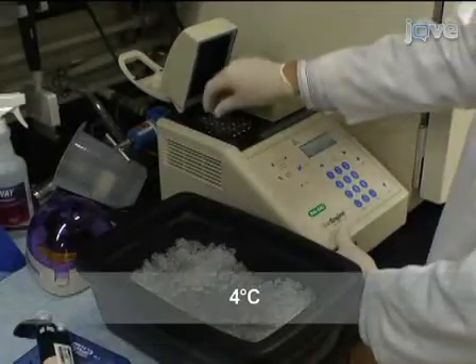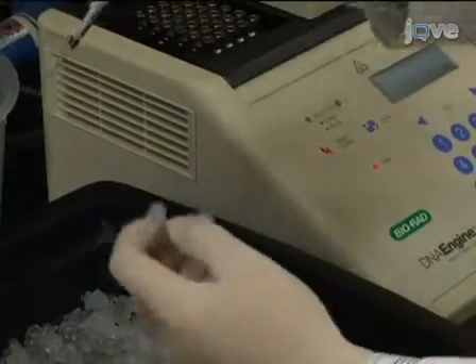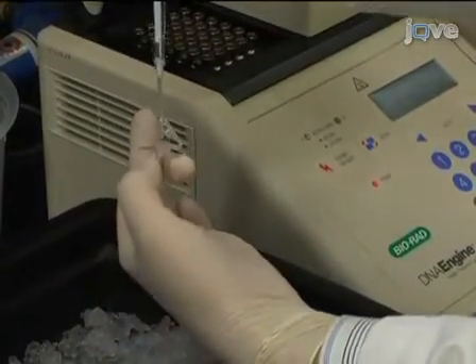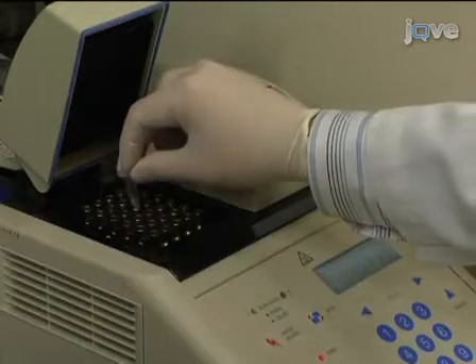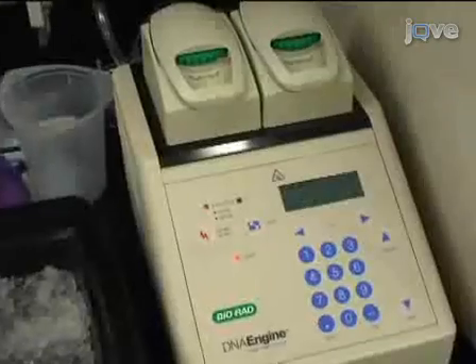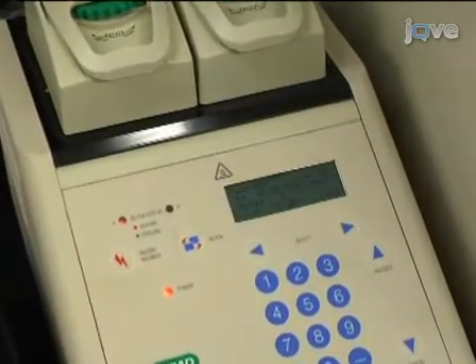Then chill the sample to 4 degrees Celsius and transfer to an ice bath. On ice, add 1 microliter of RNase H to the sample and incubate for 20 minutes at 37 degrees Celsius. RNase H degrades the RNA template, leaving only the single-strand cDNA product. cDNA synthesis is now complete, requiring only an additional clean-up and concentration step.